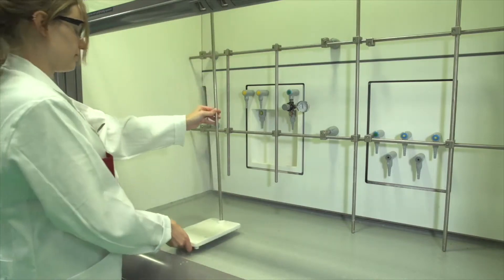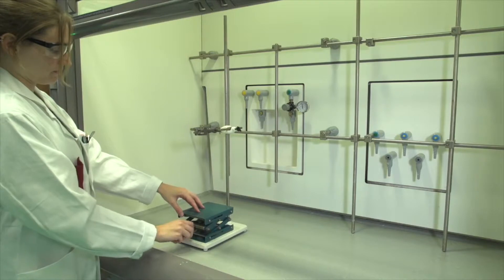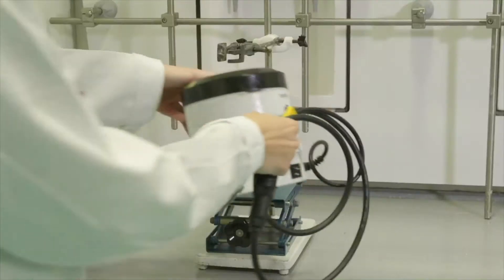Place the stand in the fume hood and attach a clamp to it. A support jack is placed on the foot of the stand. The isomantle is placed on this.